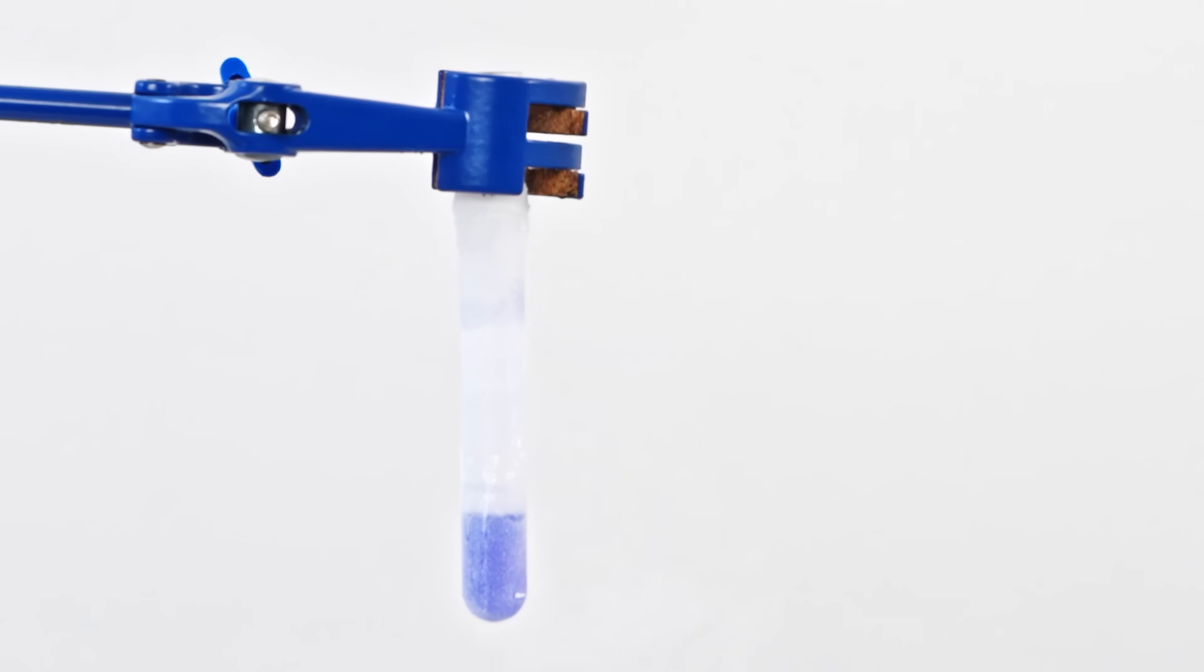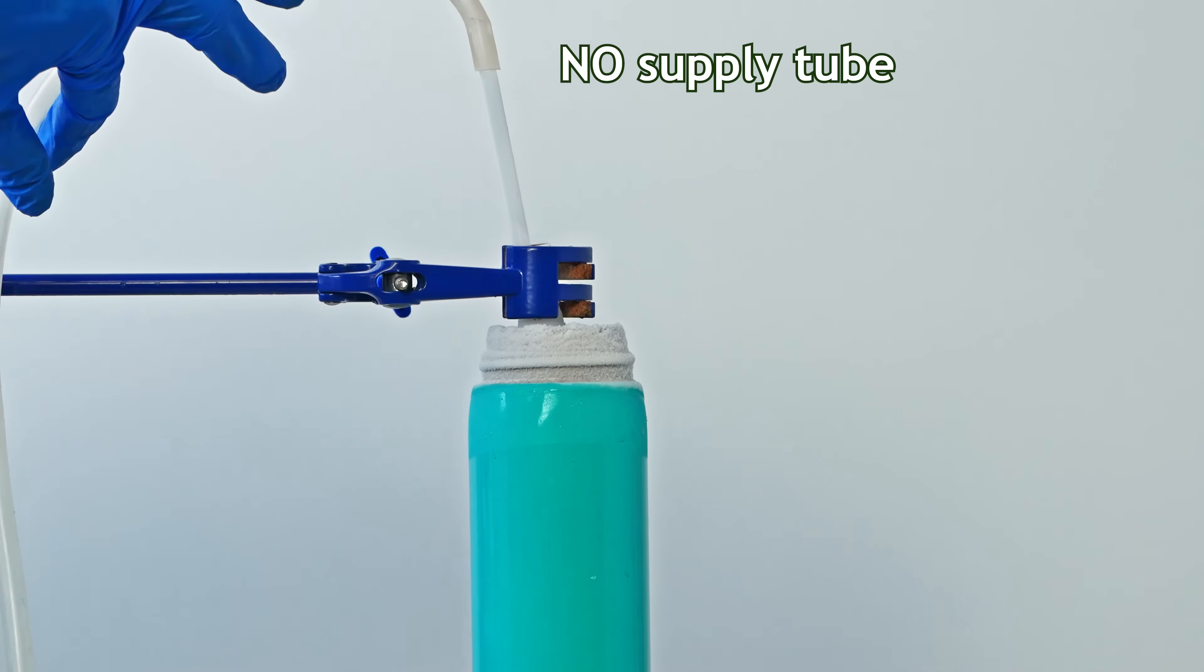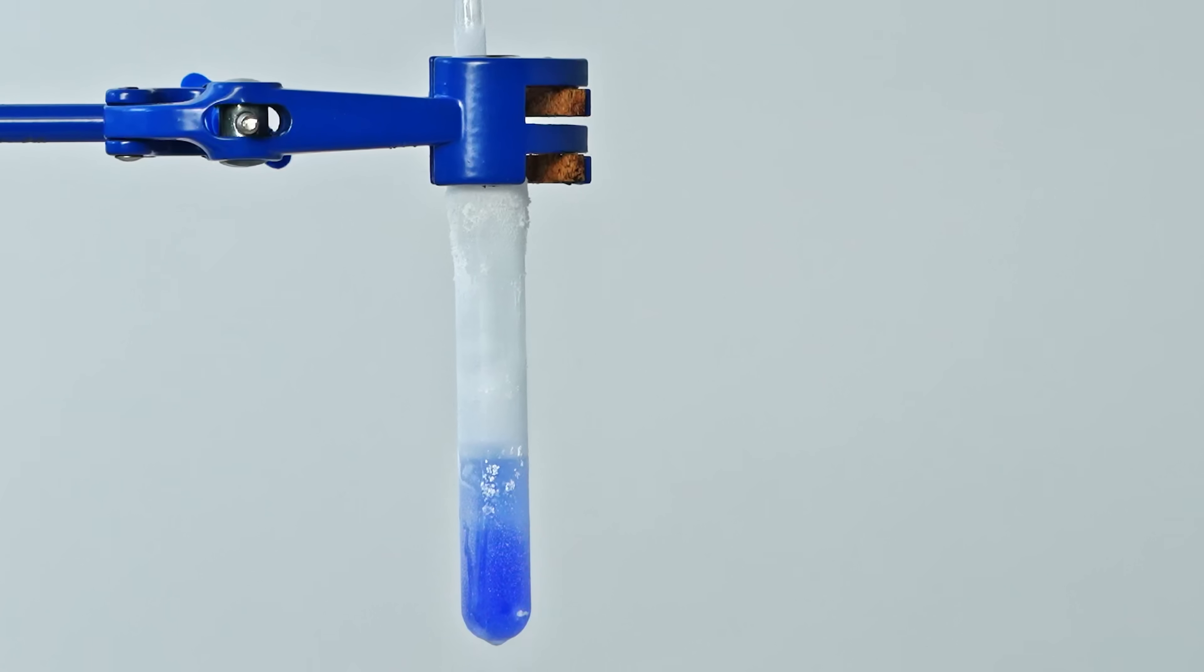I condensed a small amount of ozonated oxygen and lowered a tube into it to introduce nitric oxide. When I opened the cylinder valve, a small amount of nitrogen monoxide entered the condensed ozonated oxygen.